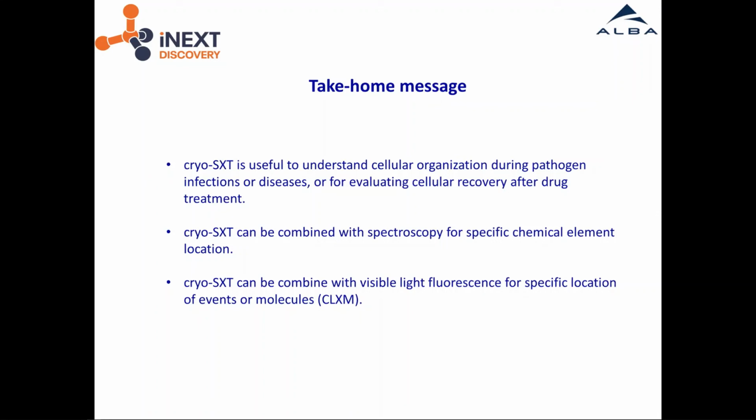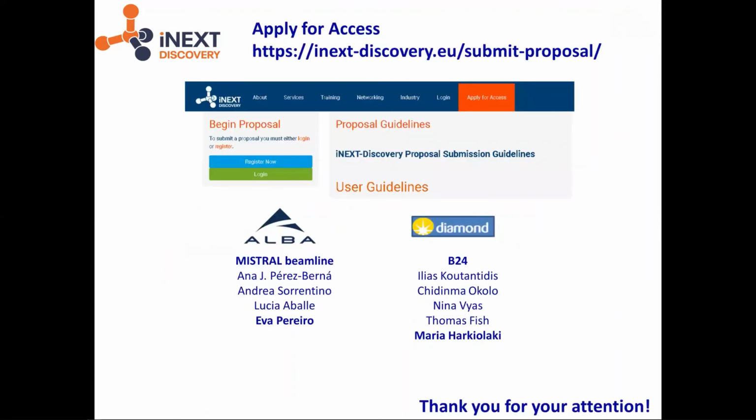We can not only do tomography, so 3D reconstruction, but we can also use the energy tuning to do spectroscopy of your cell. And many of our users and ourselves are always working in correlative imaging strategies to understand what is going on inside of the cell.